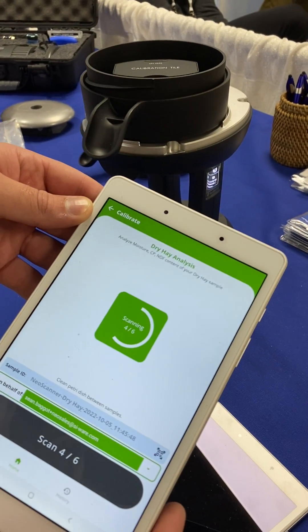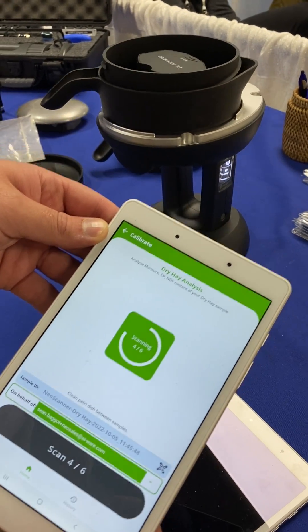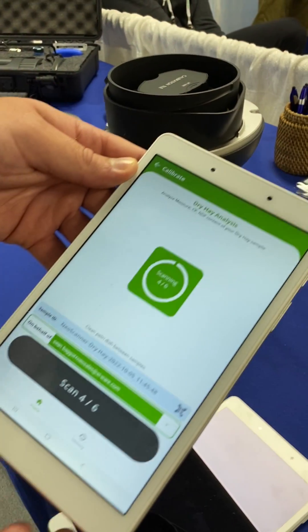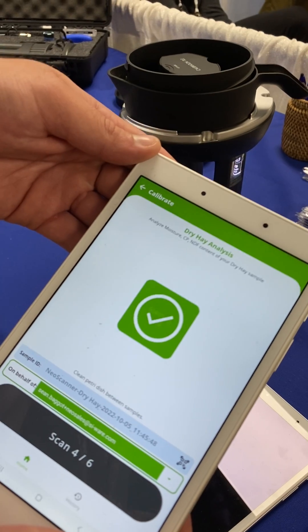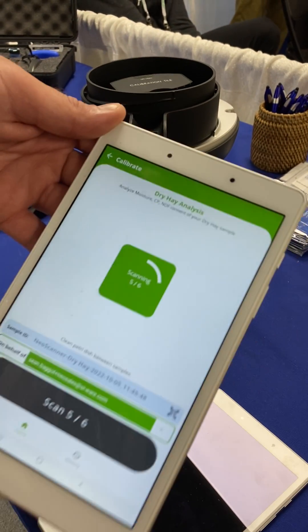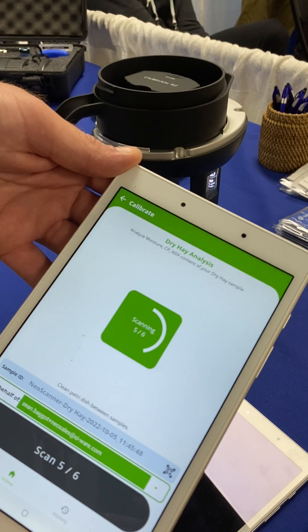It takes about one to two minutes to give you a final result depending on the homogeneity of the sample. For forages we'll want about five to six sub-scans to really characterize that variation in the sample.